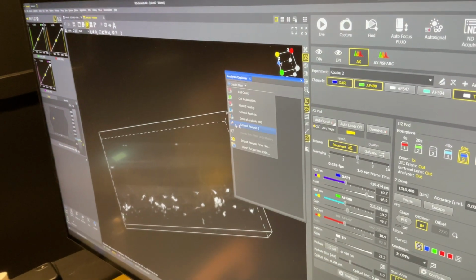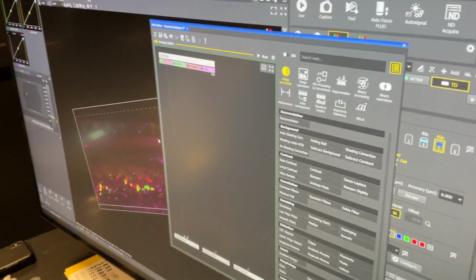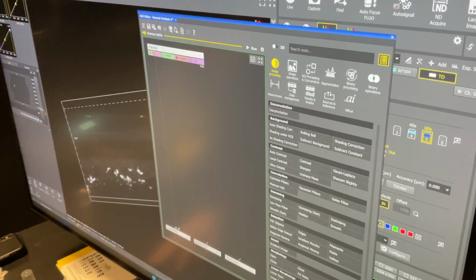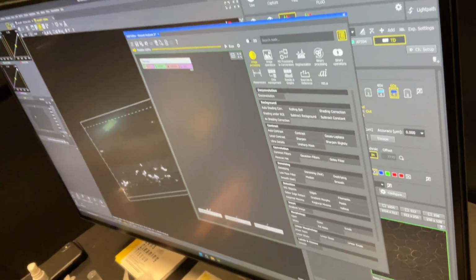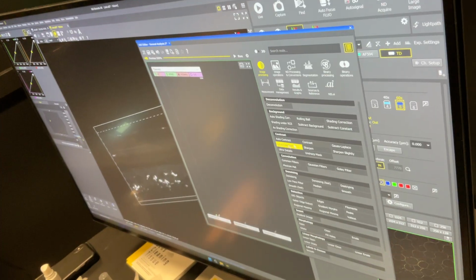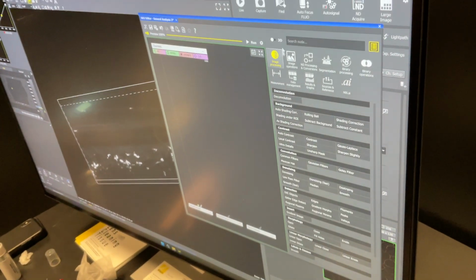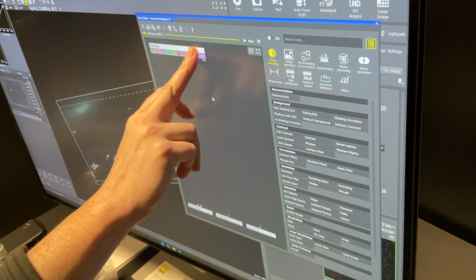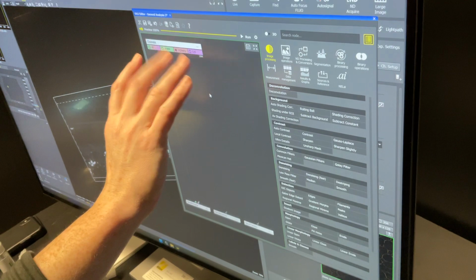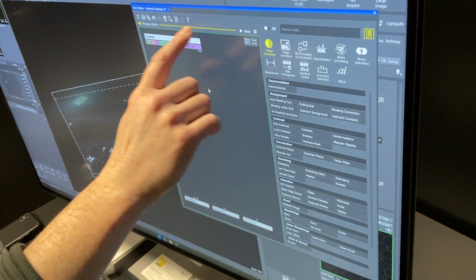All right. So GA3. I'm not going to say General Analysis 3 every time. So red cells and far red as a thing to measure in them, right? Yeah. Okay. So, for you guys, this is the workspace of GA3. We're going to have all of our inputs and all of our outputs, and then we're going to do things to them. We have our preview. This is our progress bar.